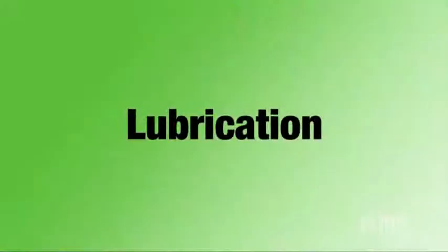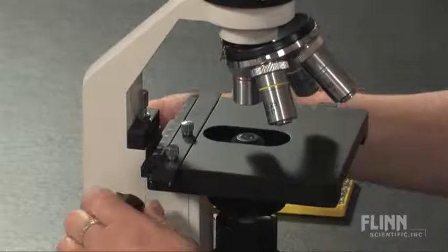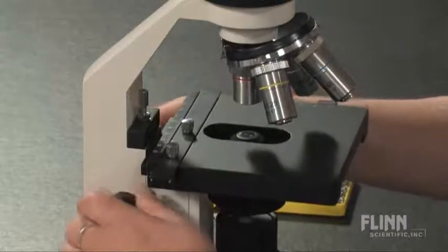A few basic maintenance steps plus routine cleaning will ensure that your microscopes last a very long time. First thing I want to talk about is lubricant. Students generally use a short focal range on the microscope, so a couple of times a year, rack the focus completely up and down, spreading the lubricant throughout the entire gear.